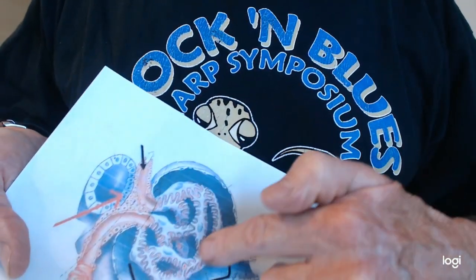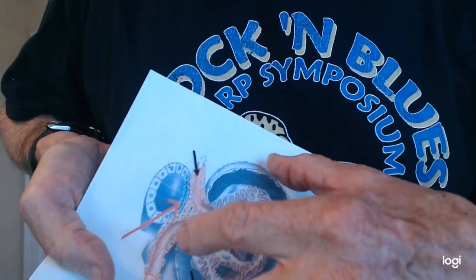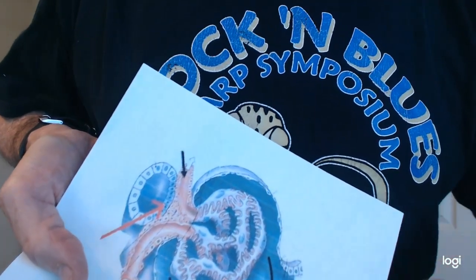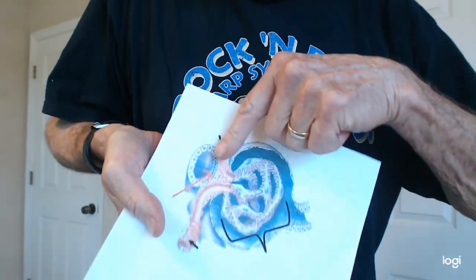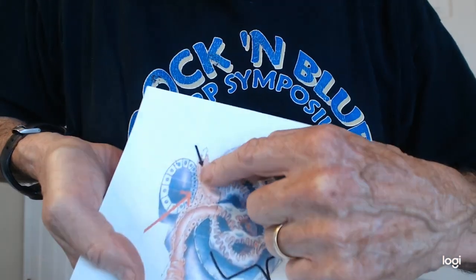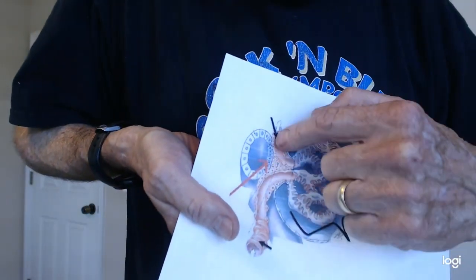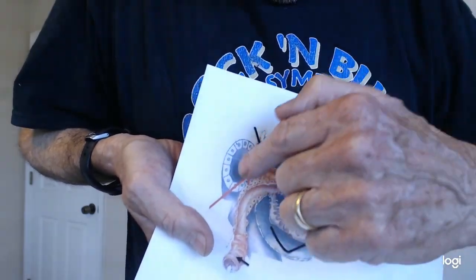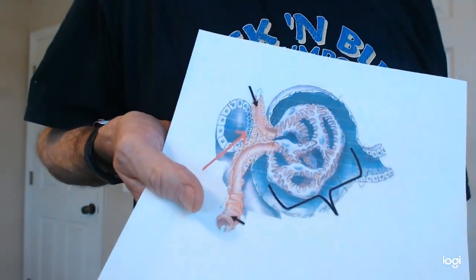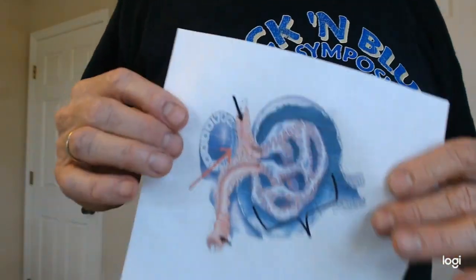The glomerular capillaries in here, inside of Bowman's capsule, filter. That becomes the primary urine. It goes all the way down the tubule. It goes down the descending loop, the ascending loop, comes back right by here. Here again is your macula densa. It means dense plaque. And there's a little group of cells here. They're usually a little darker so it looks like a plaque of sensory cells. And then it goes and dumps into the collecting duct, where, as you know, a lot of fine tuning takes place with all those principal cells in there.